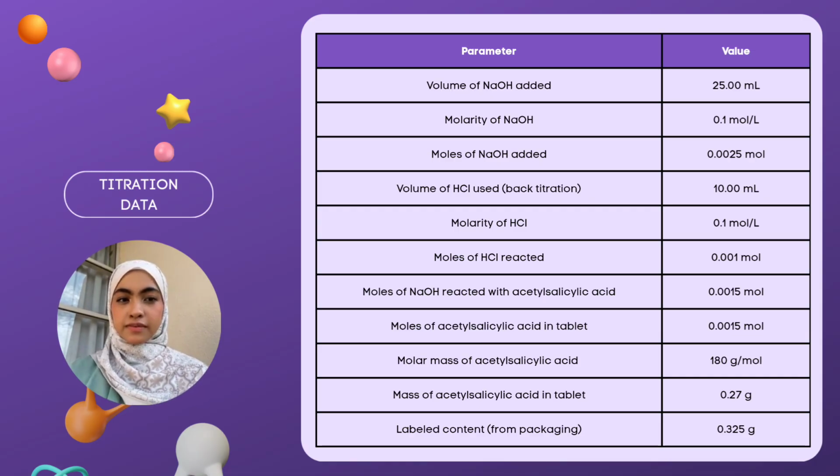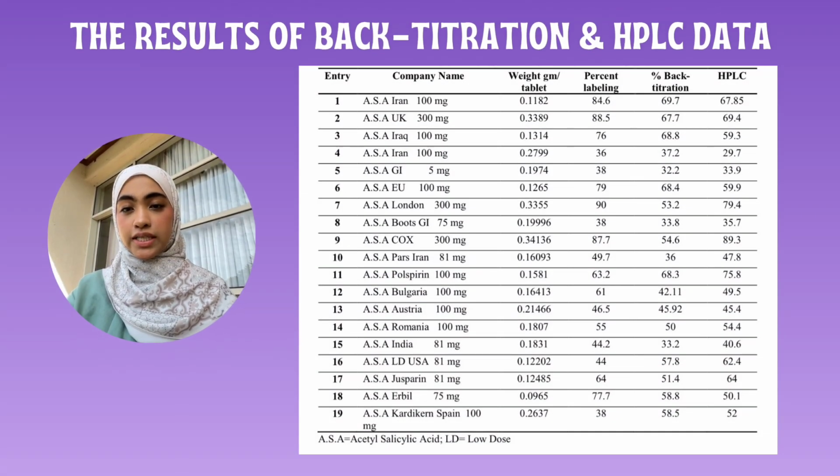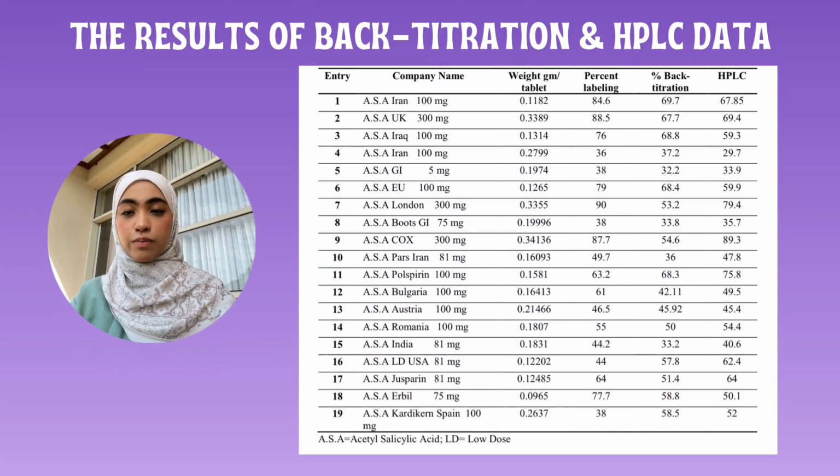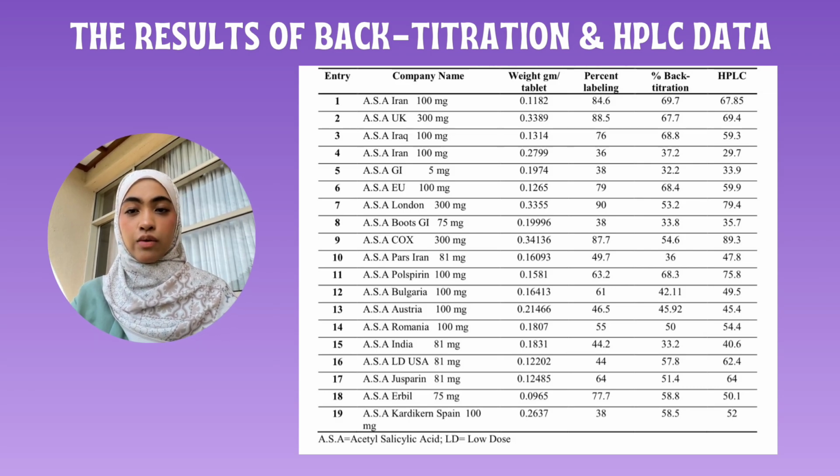And then this is the titration data that we put in a table form after the calculation part. And this is the result of back titration and HPLC data obtained from many countries such as Iran, UK, and also Europe, London, and a lot more.